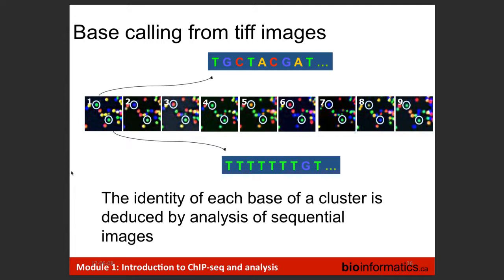Now, when we sequence some types of libraries, not usually a problem for epigenomic libraries, but if you have a library that has a low diversity, for example amplicon libraries, this can cause a problem in generating the focal map, because we have one base that essentially overwhelms the camera. Let's say it's all A's on the first base of incorporation. It overwhelms the camera and it cannot generate the focal map. That's why, maybe some of you are aware, we spike things in like phi X. We spike phi X in to provide that diversity to allow it to assign a position to the X and Y coordinates, okay?